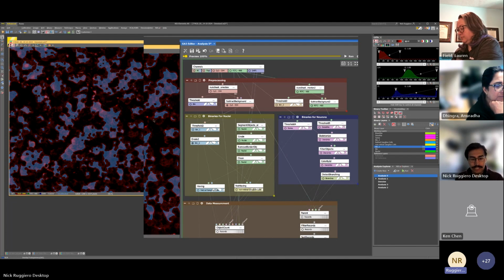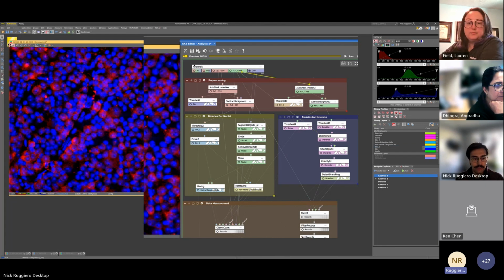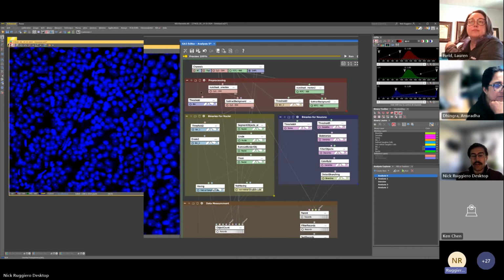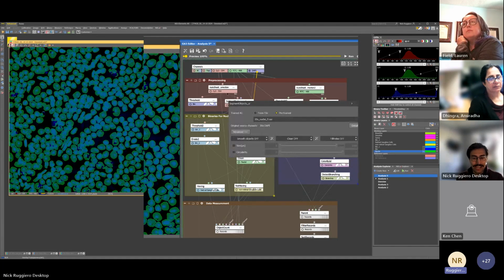So the next thing that I did is I'm going to get rid of all that stuff, and I'm going to go into my DAPI channel. We're going to not look at this one for now. This is a segment objects AI. There are some pre-trained AIs that just come with the software. I don't recommend using them for a ton of stuff. But when I was messing around with this one, I just tried one of the pre-trained ones, and it actually worked pretty well.